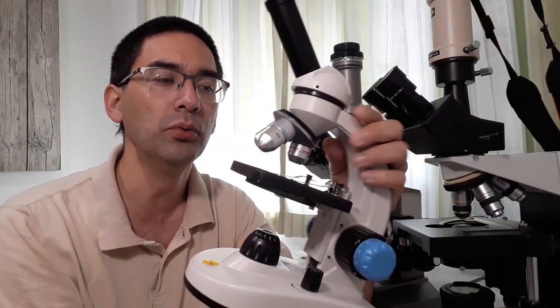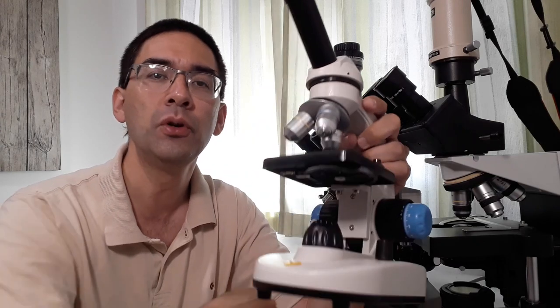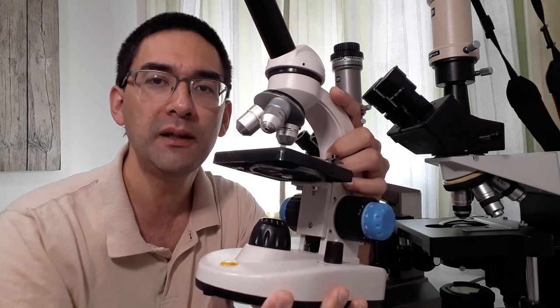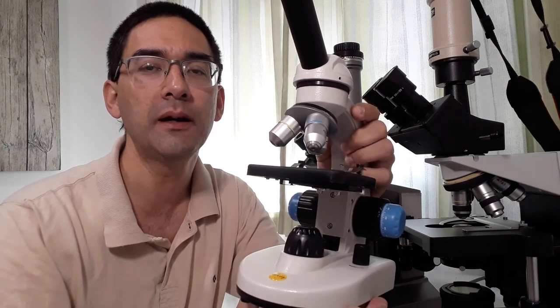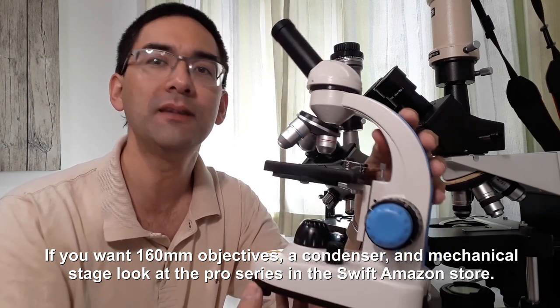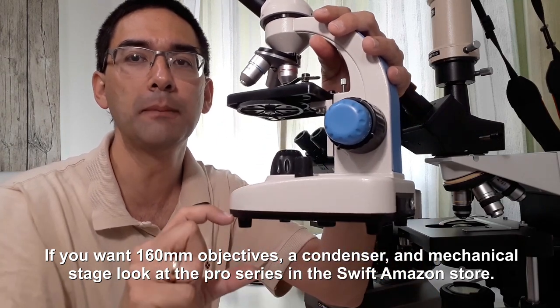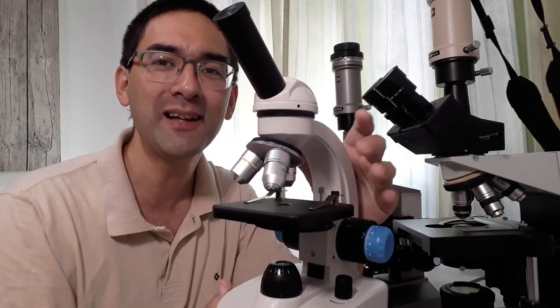Okay, so who is this microscope for and who is it not for? My general recommendation, if you are already interested in amateur microscopy and if you already know that amateur microscopy is something for you, and if you intend to spend many hours behind the microscope, then I probably would invest a little bit more money to get a microscope which is a little bit larger. The small size is an advantage under certain circumstances, but can also be seen as a disadvantage because you always have to bend down a little bit. What I have to do here is maybe put a thick book under the microscope so that you can sit more upright on the table. So the small size can be seen as an advantage or disadvantage.